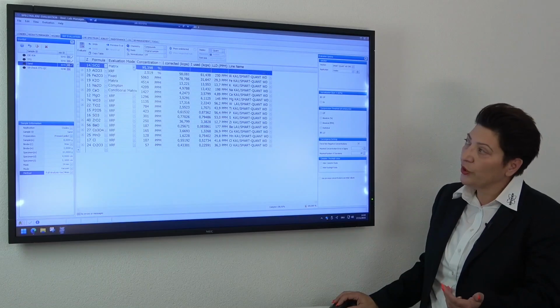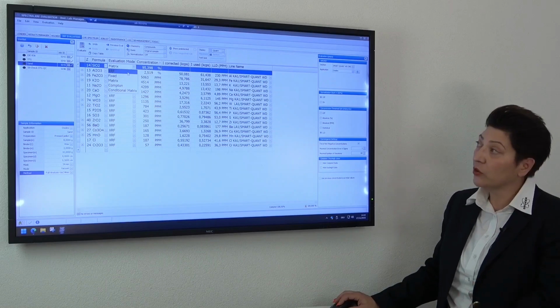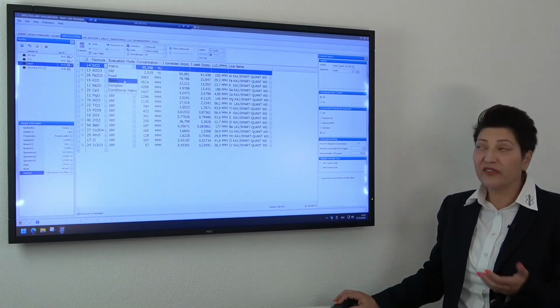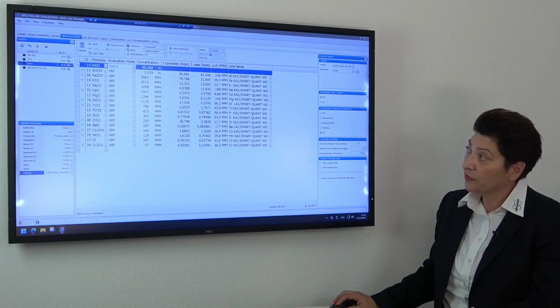You can easily switch between XRF, meaning the XRF value is used to calculate silicon, but you can also add fixed values, or you can set it as a matrix. So it's very easy to switch between different evaluation modes.